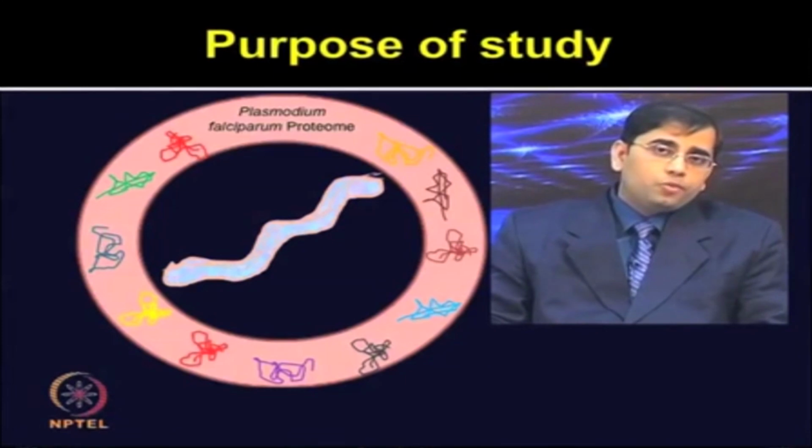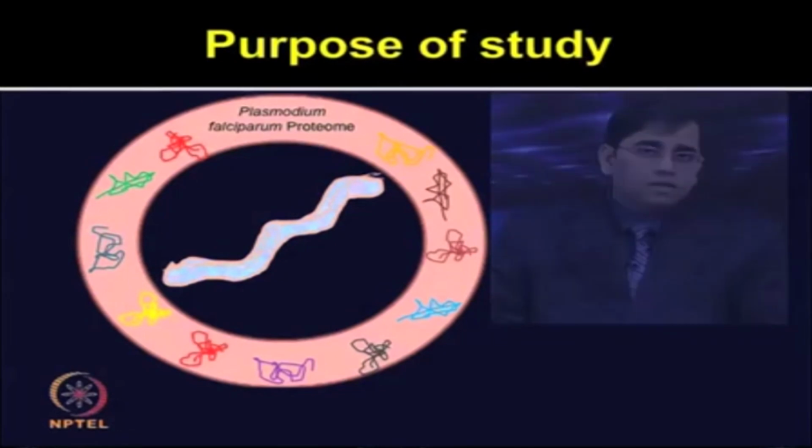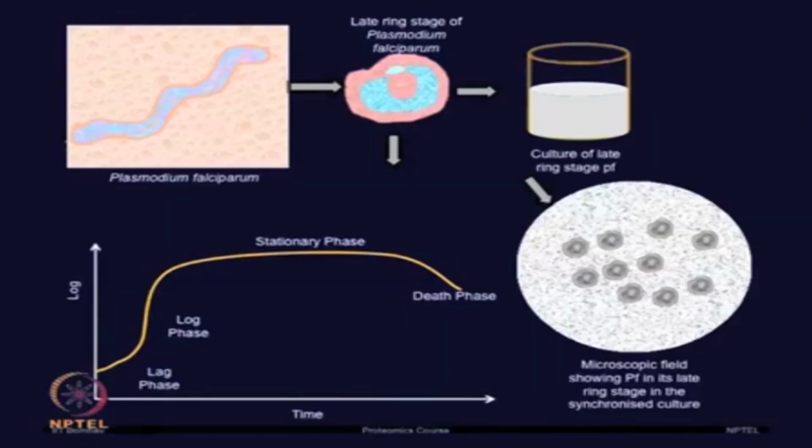So, certain proteins were found to be commonly upregulated due to both of these drugs, and certain proteins have different patterns. But before looking at the proteomic alterations, authors first determined IC10, IC20, IC50 and IC90 values for both the drugs, ARM and LUM.